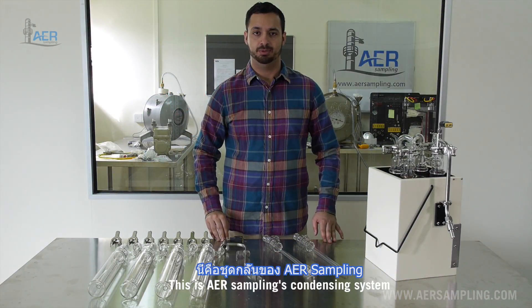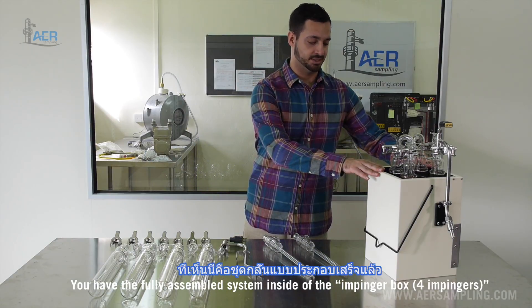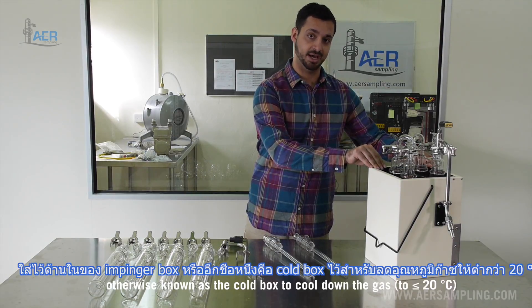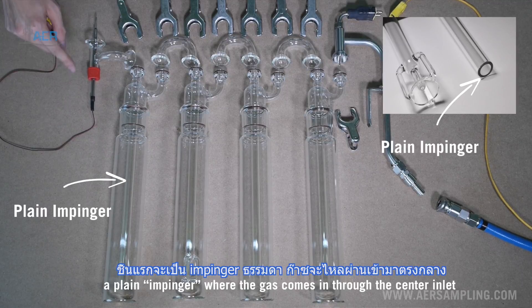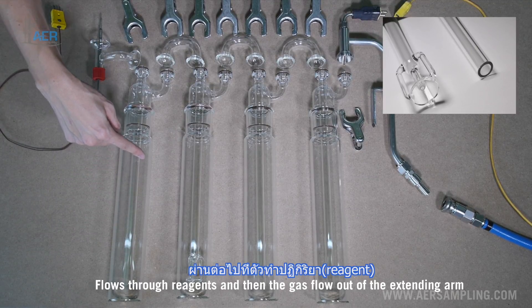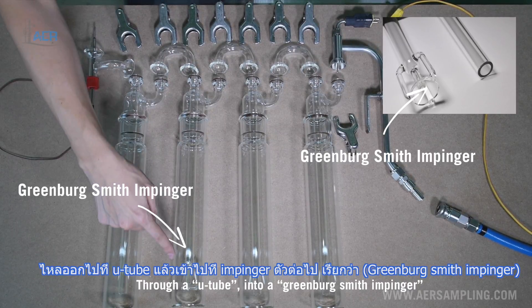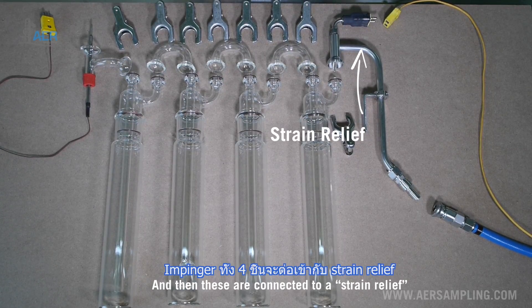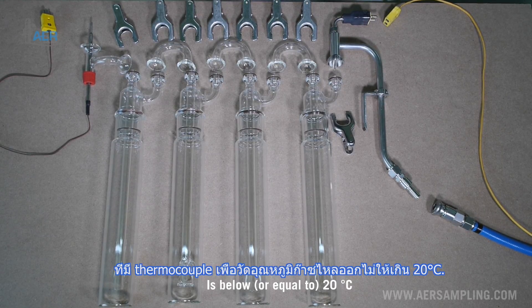This is AER Sampling's condensing system. We have the fully assembled system inside of the impinger box, otherwise known as a cold box, to cool down the gas. Inside the box we have four impingers: a plain impinger where the gas comes in through the center inlet, flows through reagents, and then the gas flows out of the extending arm through a U-tube into a Greenberg-Smith impinger, and then out through two more plain impingers. These are connected to a strain relief with a thermocouple to ensure that the temperature of the gas flowing out is below 20 degrees Celsius.